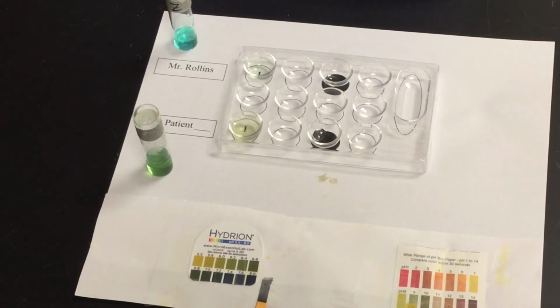So think about that along with his symptoms. Go to his slide for patient number 7. You will do a microscopic view of that as well, and maybe that will help you determine what this particular patient can be diagnosed with.